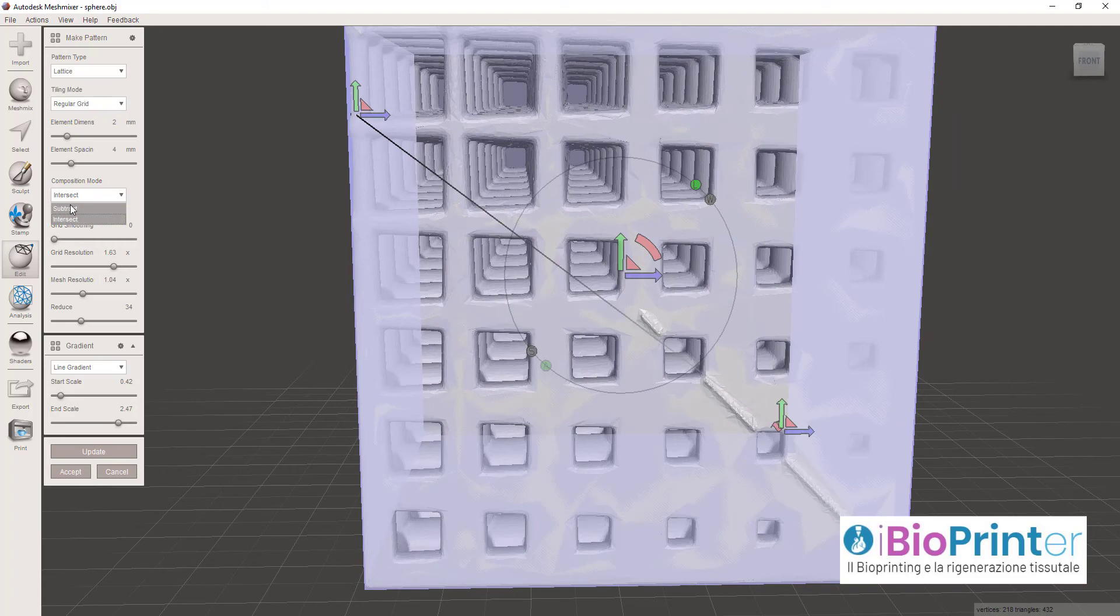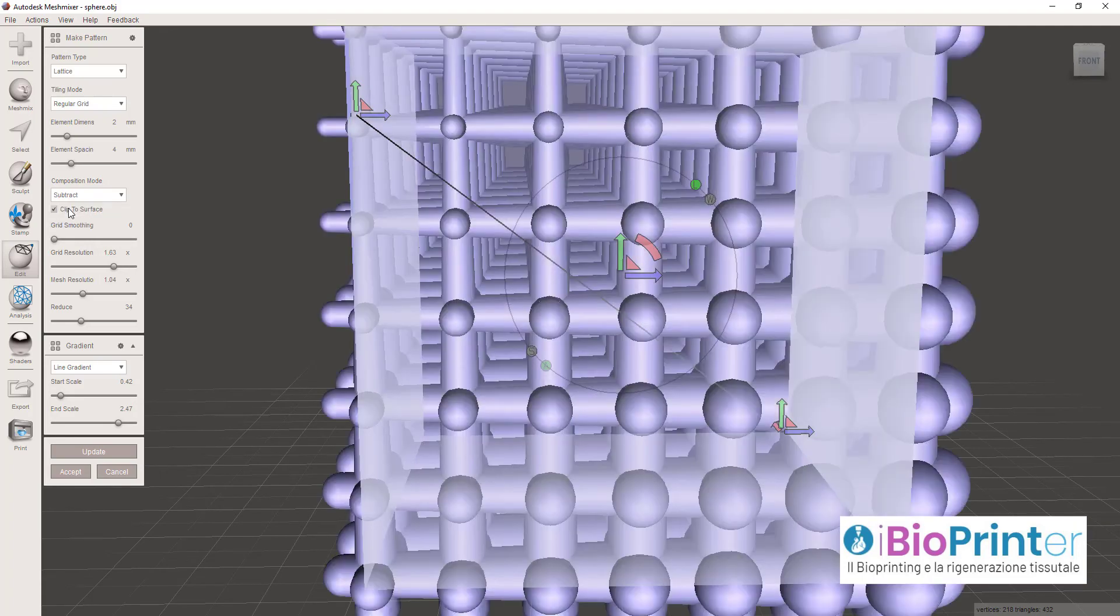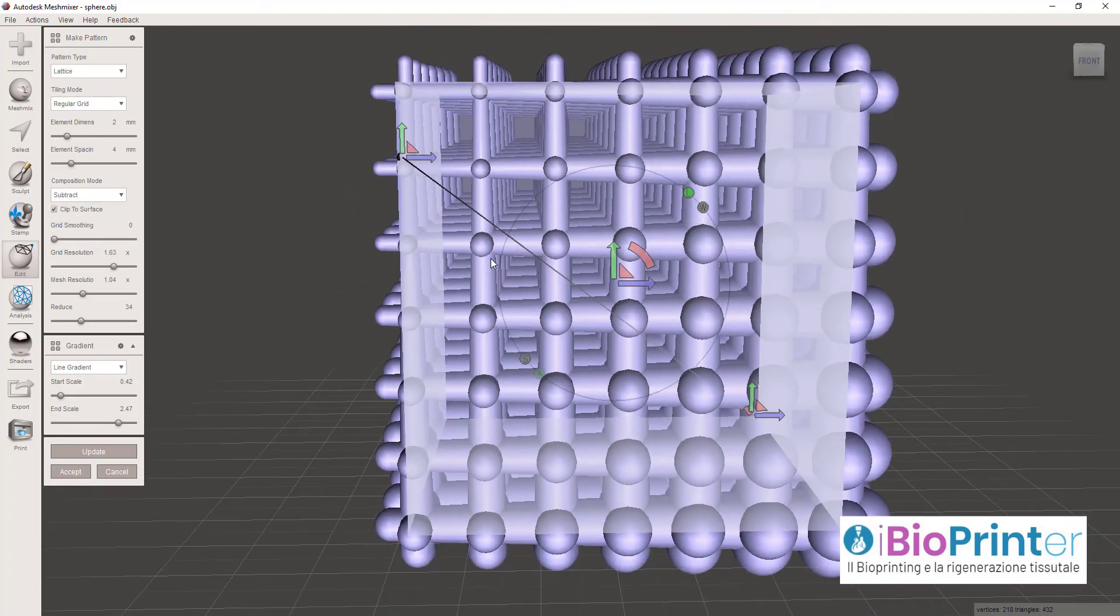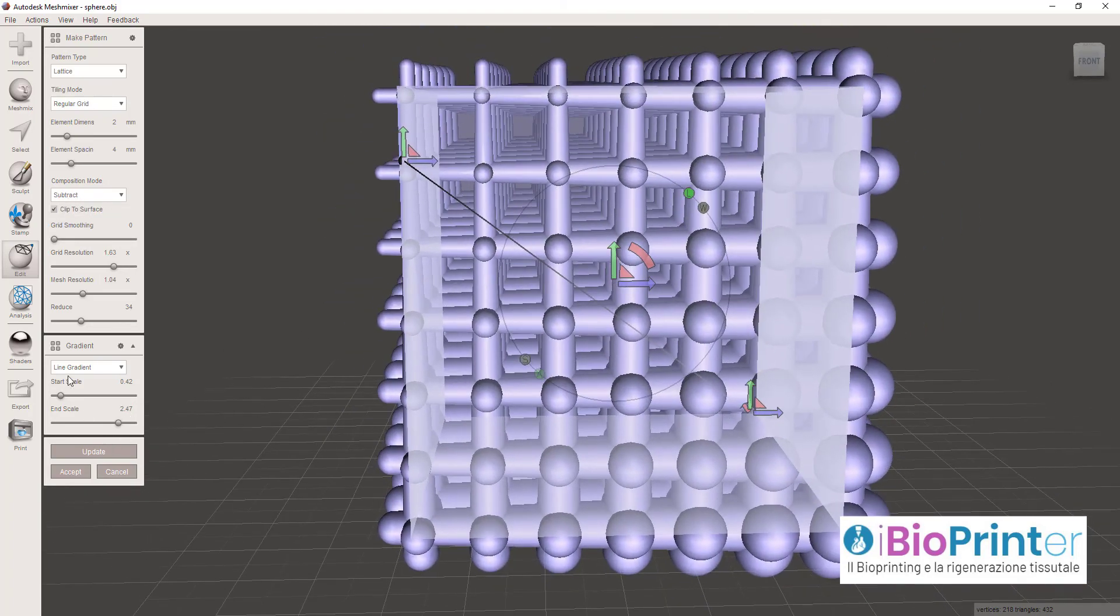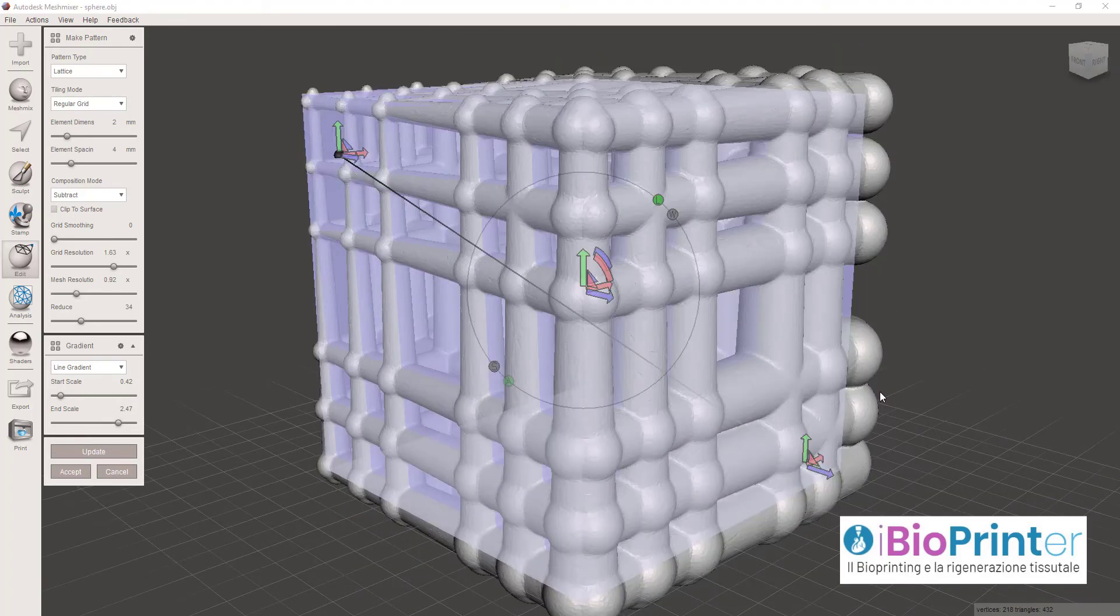Se avessi selezionato invece che Intersect Subtract, avremmo avuto questa struttura qui.